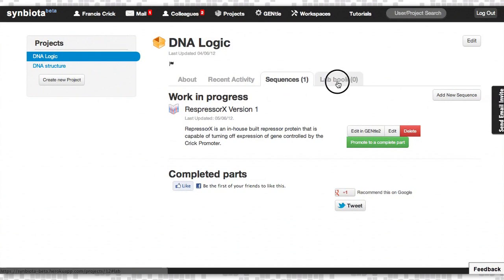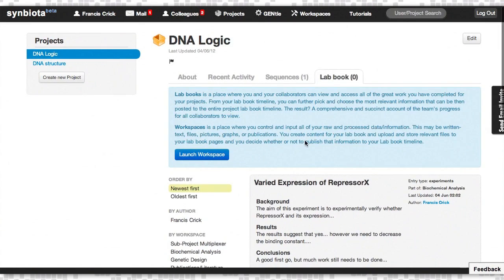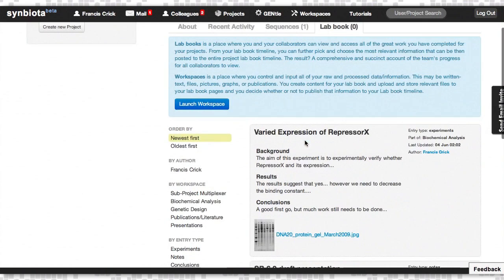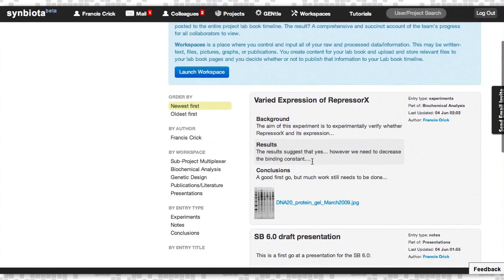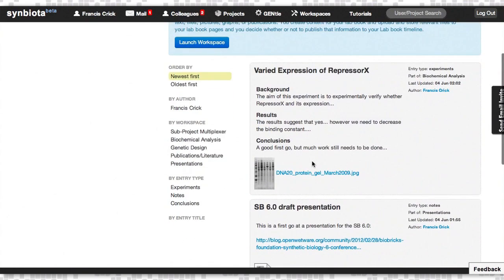There's LabBook, which is a timeline of all the information that has been contributed to this project by you and your collaborators.